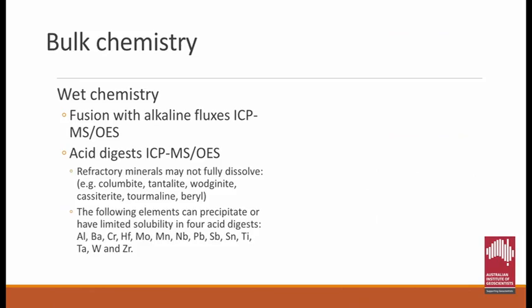Wet chemistry, again, a very standard technique. Each laboratory has it, and there are two major methods to analyze for lithium, which is fusion with alkaline fluxes, and acid digests. And with regards to lithium, there is not much difference in the results. However, if your sample would have some refractory minerals, tantalum or niobium minerals that contain these elements, you may not completely dissolve them in acid, and fusion will be the most appropriate technique in this sense.